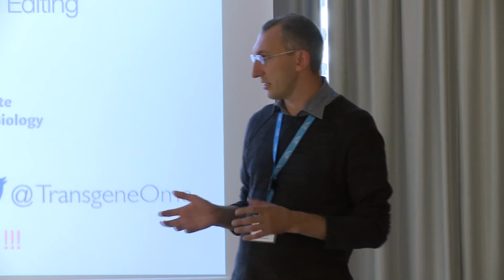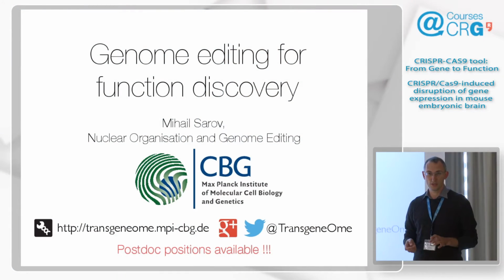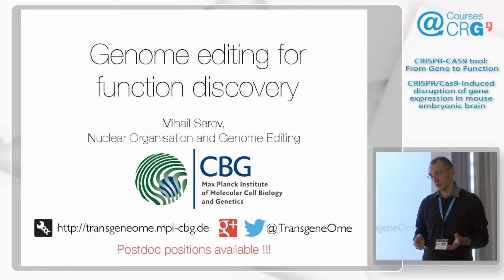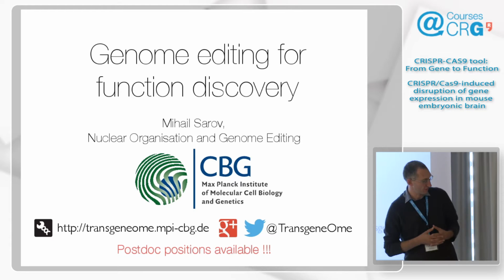So like Carl said, our lab also runs a service, which is genome engineering, and we cover anything that comes to us from the campus. So we deal with all sorts of model organisms. I will limit myself today mostly to mice, but I will give you a little bit of an introduction to what we also do on the research side of the lab, which is we're interested in genome organization and ways to perturb not just genome editing, but just to change the organization of the nucleus in order to understand how the genome is organized.